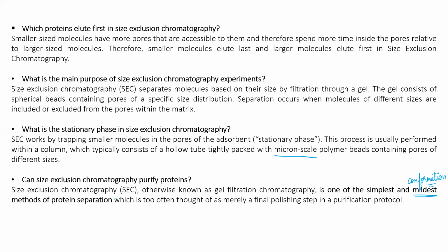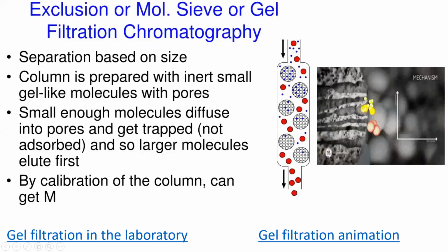No harsh chemicals are used. It's just working by using buffers. And yeah, it is actually one of the final steps in a purification protocol. So whatever you're going to get, definitely you're going to get a pure form of your analyte.